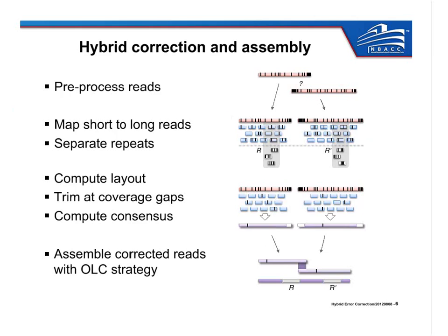Here, each of the blue boxes represents a short read. The red reads represent a PacBio read. And each of the little tick marks represents an error in the mapping. So if you're running, say, a Bowtie aligner, this is the number of errors that you would be tolerating. Our overlapping step uses the overlap code that's in the Celera assembler, which is a traditional seed and extend algorithm.